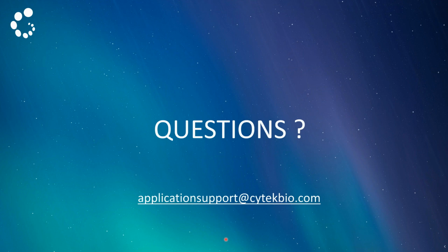Basically, you do them once, you save them, and when you do the adjustment, do it wisely. Consult with us if you want to understand how to make sure that those settings are optimal, and then you save them and reuse them as you would reuse Cytek assay settings. So you do it one day and you're set. I hope that answered the question.